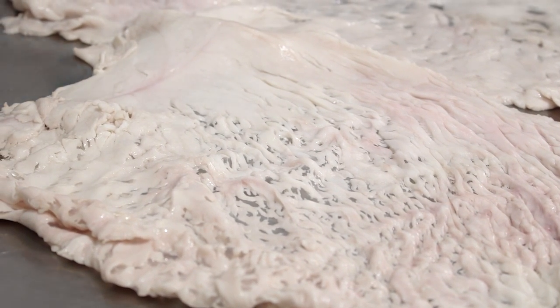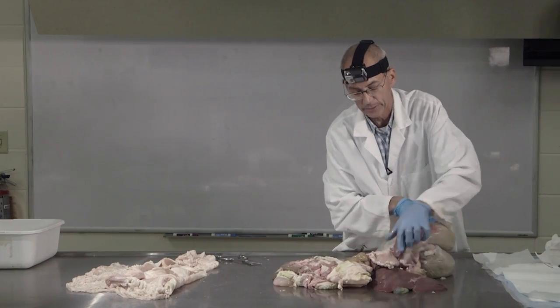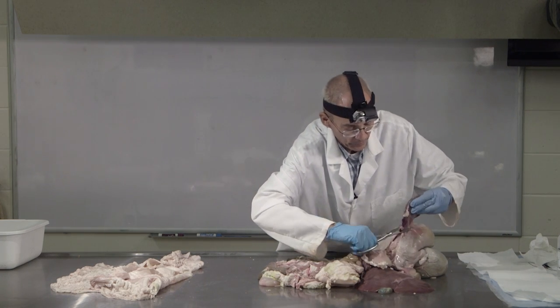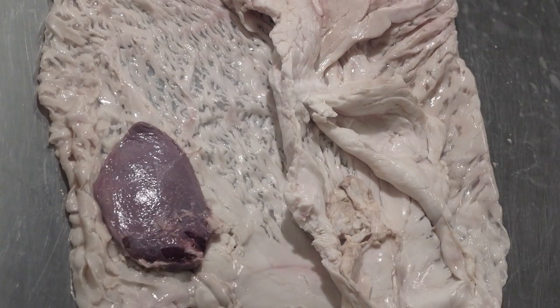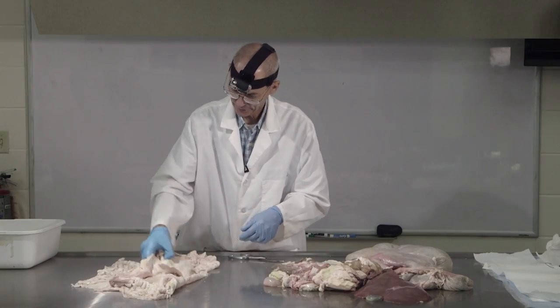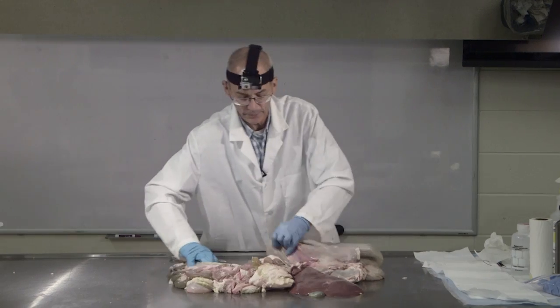a lot of fat deposition in there, and then associated with that, I must have blunt dissected it away. Here we go. And then here's the spleen. It's separated from the omentum this time when I did my blunt dissection. So there's the spleen, quite a bit different shape compared to the pig, and the pig was real long and so on. But that's the spleen. Again, really a part of the immune system, more so, doesn't really have any function from a digestion standpoint.